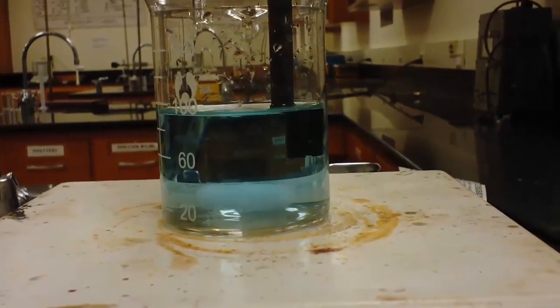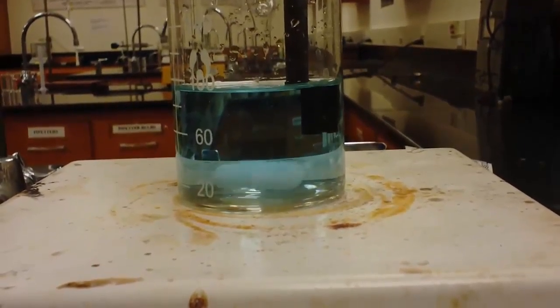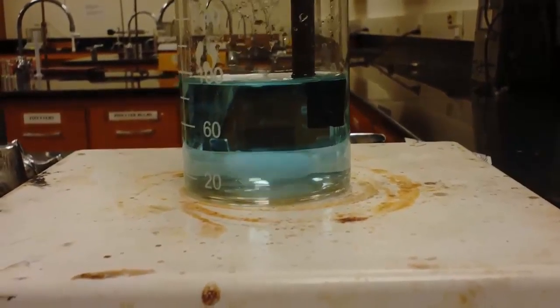If the spin bar hits the end of the pH meter, it can damage it. This is about the speed that you want your solution to be spinning. This ensures continuing mixing.